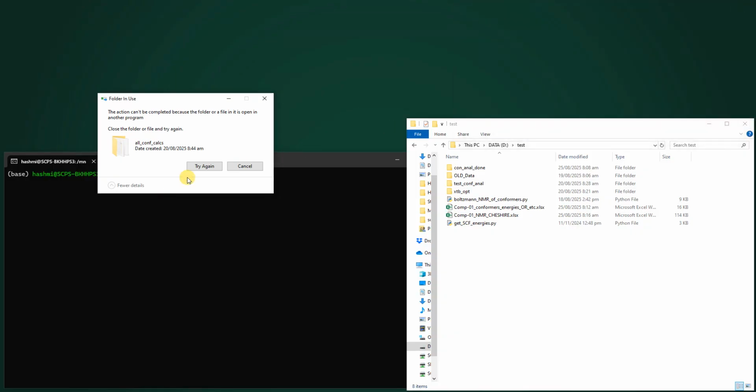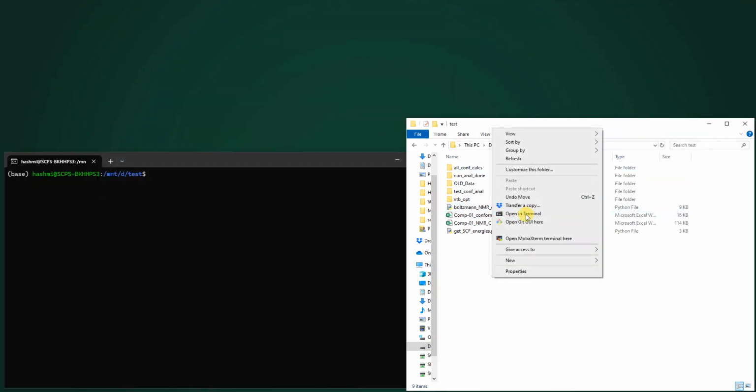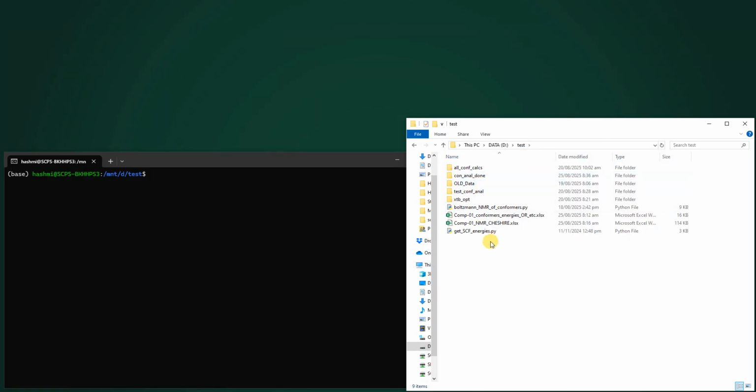It's being used by GaussView, so yeah, here it is. Now if you look, your scripts are here and the folder is here. You can use them from anywhere, but I just did it because I want you to be at ease and understand how things are happening in this video.